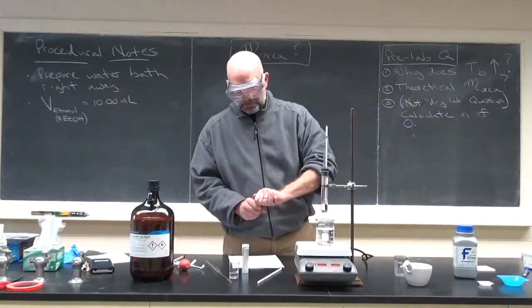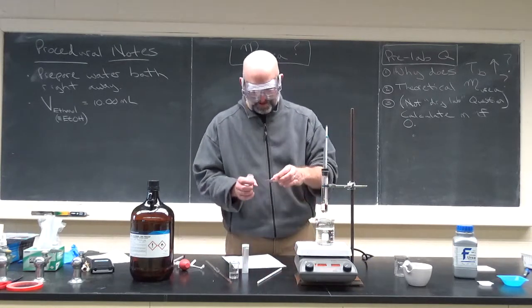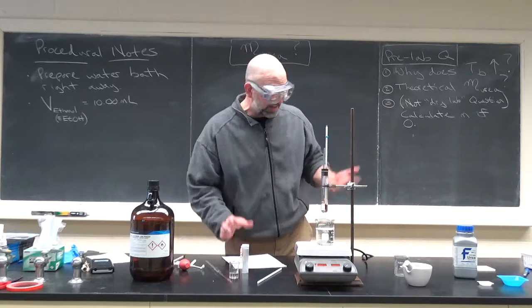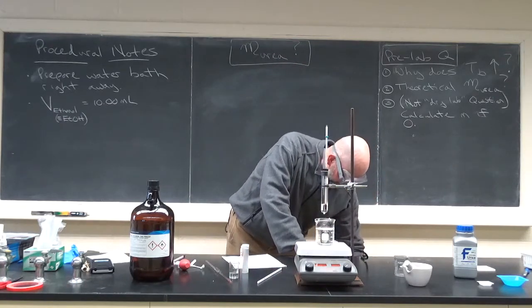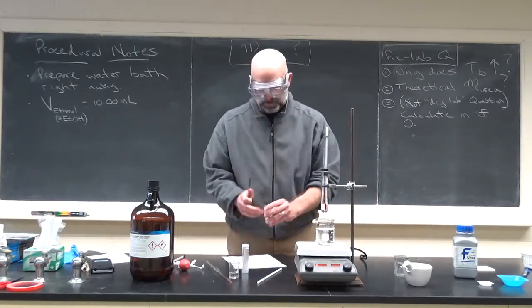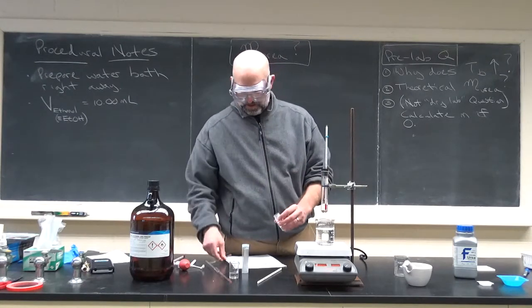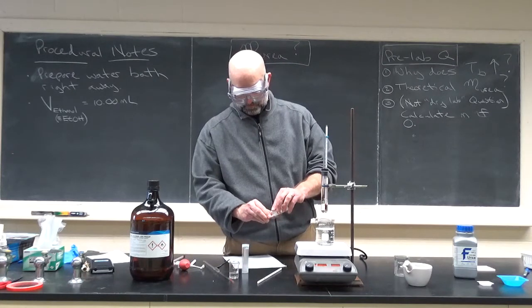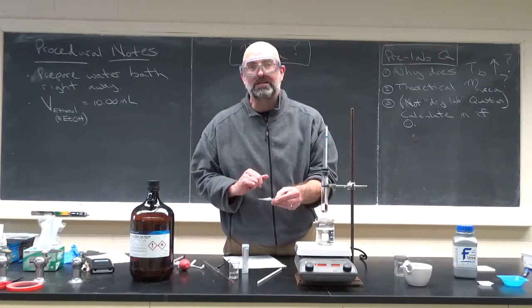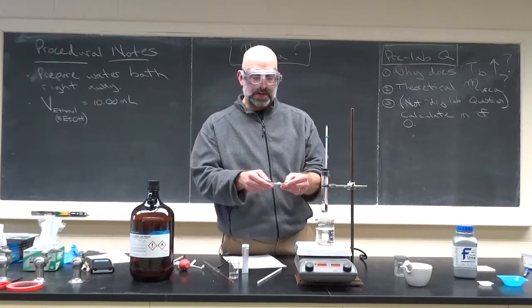Just to show you, they're kind of big crystals. These crystals here are fairly sticky. You've dealt with this before. These crystals are like little beads almost. I can't tilt it because it's going to make a mess. They almost look like little white ball bearings. Those are actually going to take a little while to dissolve if you leave them as those spherical particles.